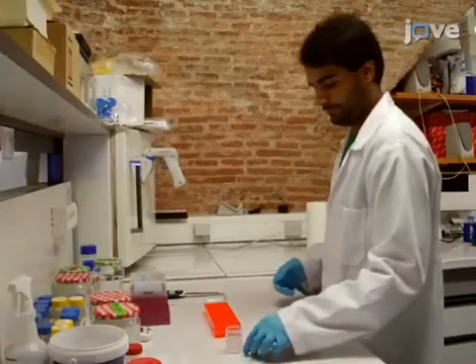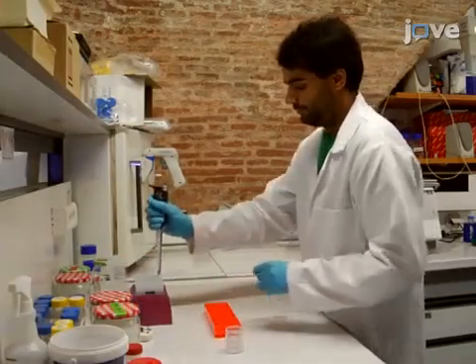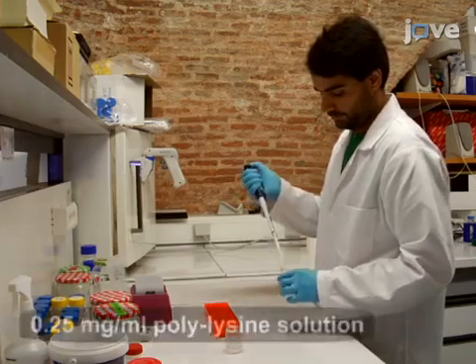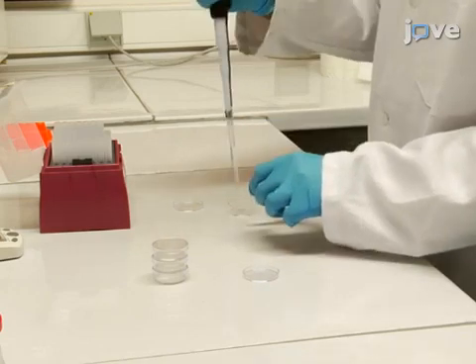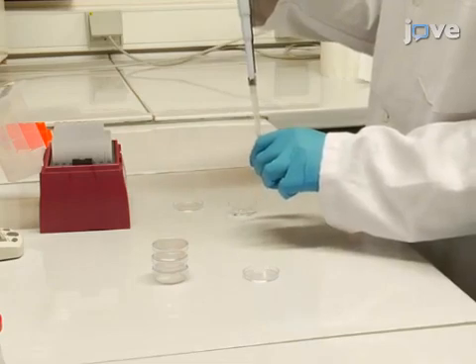To begin, prepare the polylysine-coated dishes used to immobilize the oocytes during the injection. For each 35 mm cell culture petri dish, cover the bottom with polylysine solution and incubate at room temperature for 5 minutes. Next, transfer the polylysine solution into another dish and again incubate at room temperature for 5 minutes.